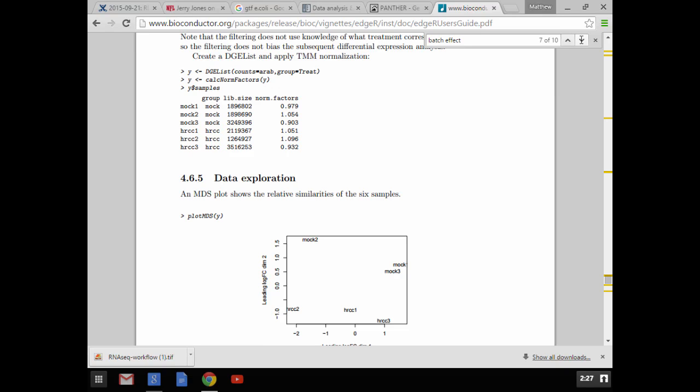And the last thing that I really wanted to bring up in all of this is that all of the things that I'm giving you in EdgeR are scripted here because we know it's going to work, but it is almost always something that you're going to go through in iterations. This is the stage where you actually run something, look at it, check something out, and run it again after you change a couple of things.